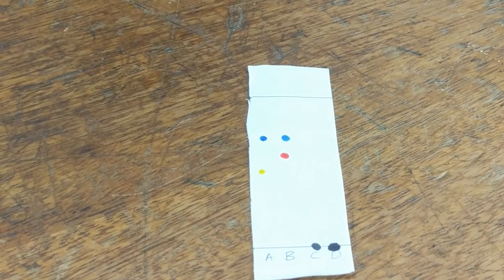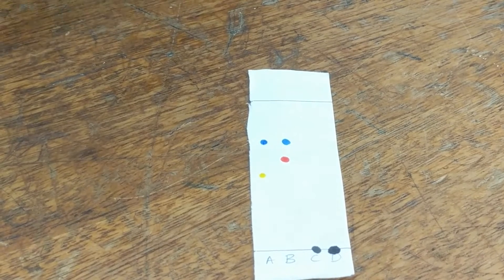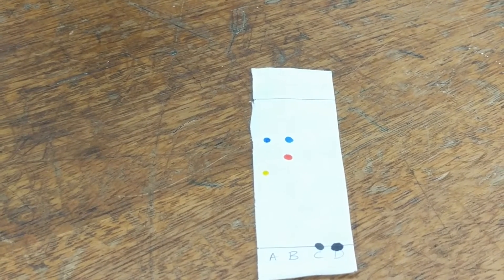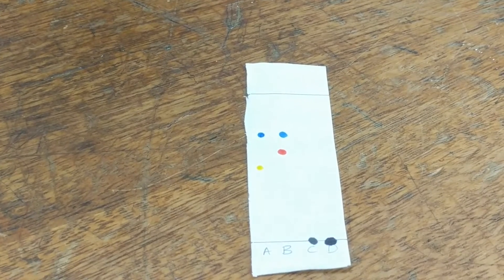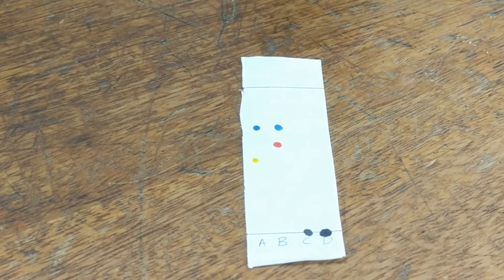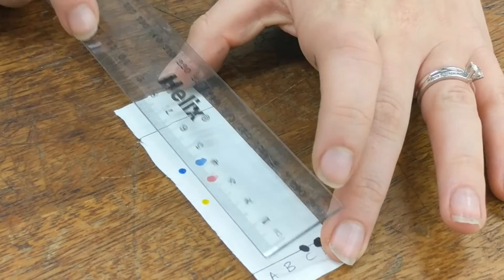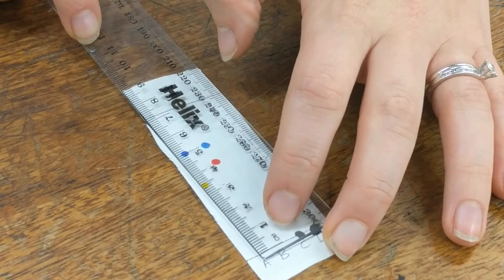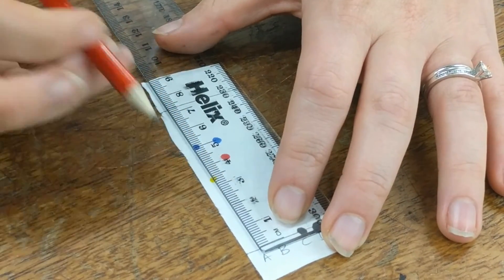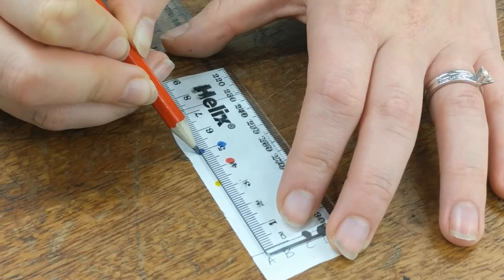Now, although we're saying that they're about the same height, the same colour, there is a much more accurate way of doing this. And that's by calculating something called the RF value. Now, to do this, we need to measure the distance from the bottom line. And I'm going to look at the blue spot. From the bottom line to the middle of the spot, which is looking at 5 centimetres there.